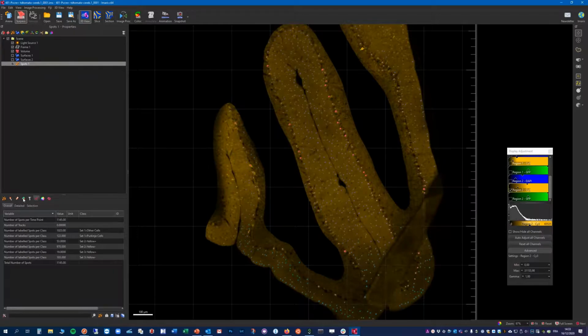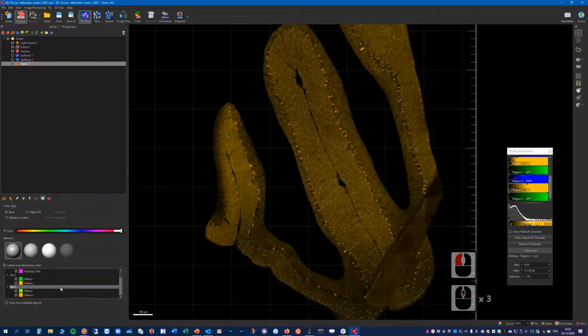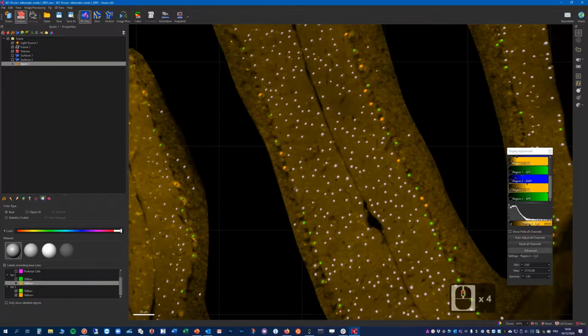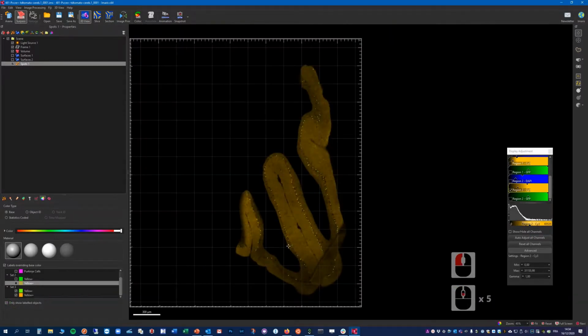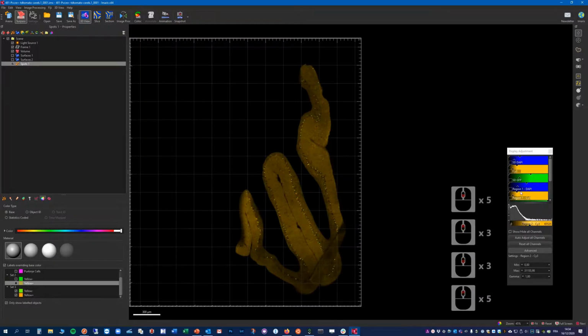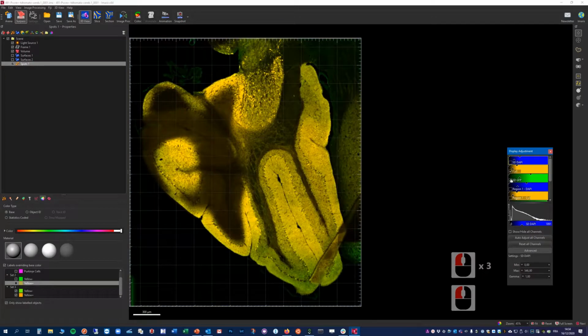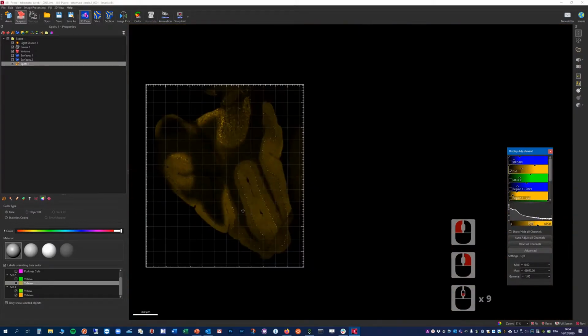And if you, for instance, want to display, so it's not yet, sorry, it's here in display, you can see here only the classes we are interested in. You can, for instance, check, okay, with the Purkinje cells, which are the ones we are interested in. So we will see in color the yellow are the positive ones, the green are the negative ones. And if we check here, we will get rid of all the other cells. So it's a nice way to display this, and we can even go back to the original data set, to see our detection here on our original data set here.